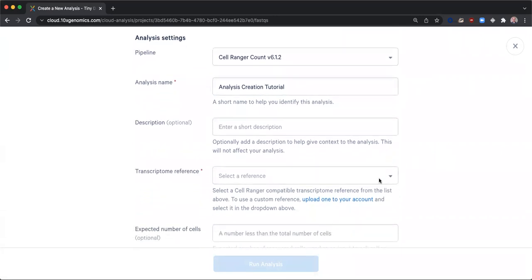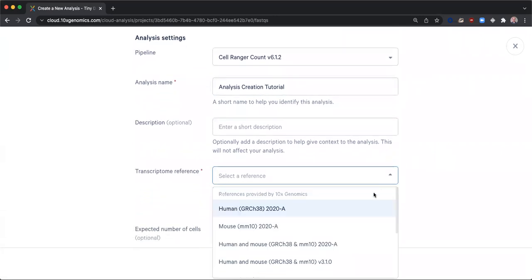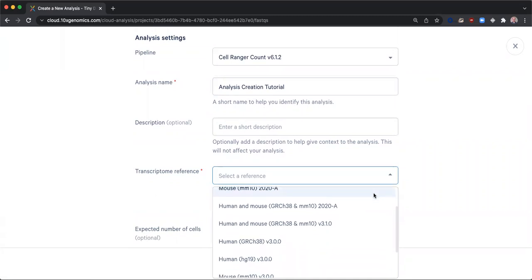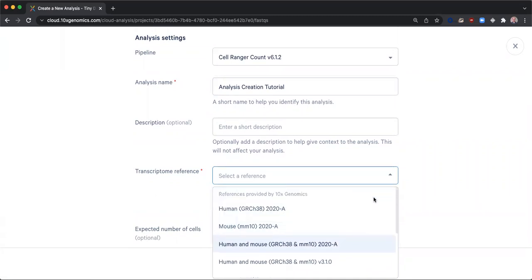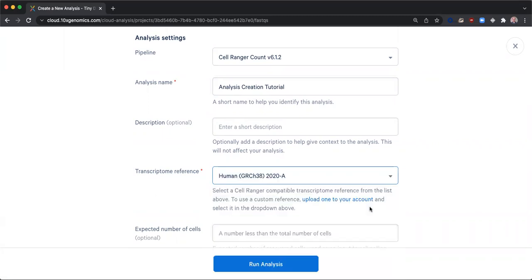10xGenomics provides multiple human, mouse, and multi-species references that you can select from. If these references do not meet your needs, you also have the option to upload a custom reference and use it on cloud analysis. My sample is from a human, so I will select the human 2020A reference in my analysis.